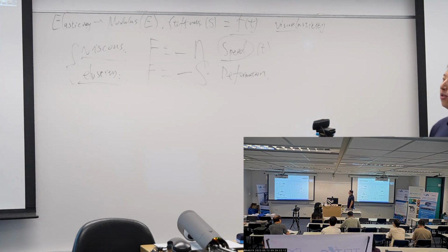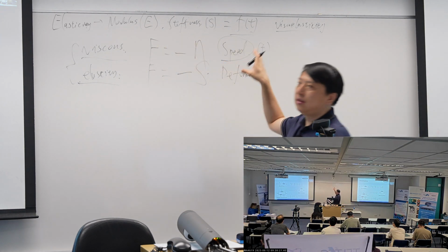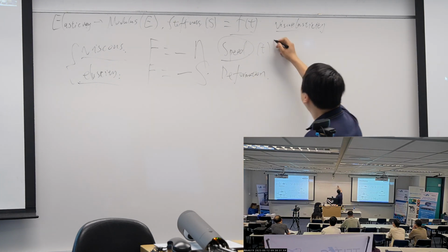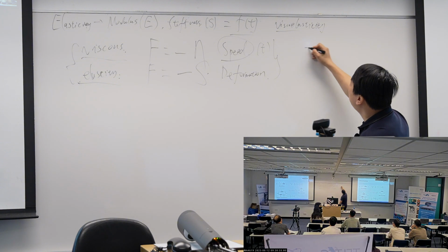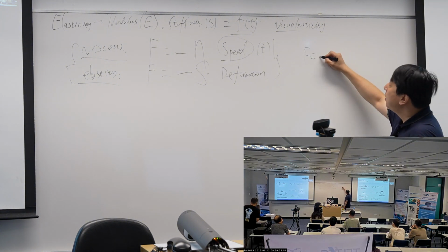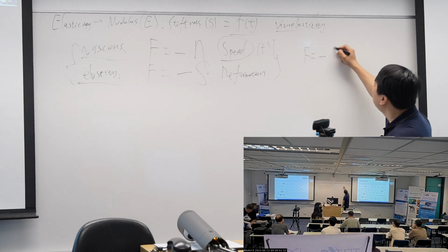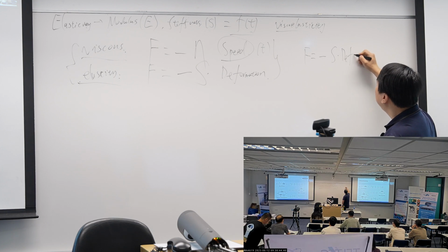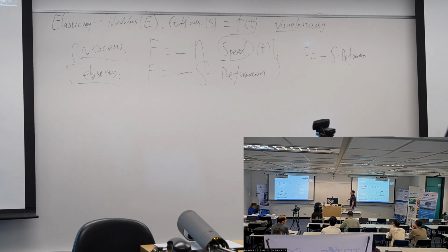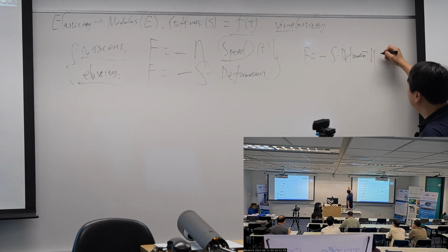To describe that, they also start from Newton's law. The force we sense should be a combination: our material looks like a solid, so it shows elasticity, and sometimes it shows viscosity, so I need to add the hydrodynamic force.